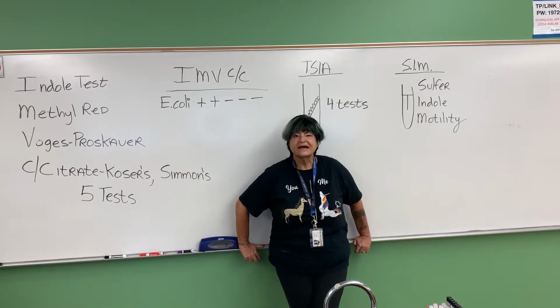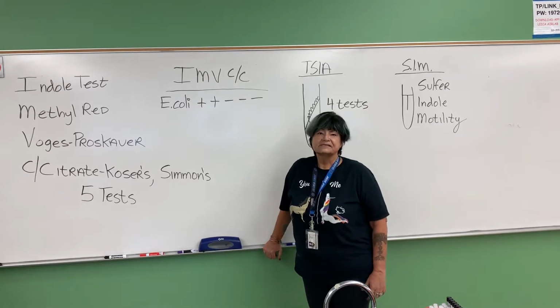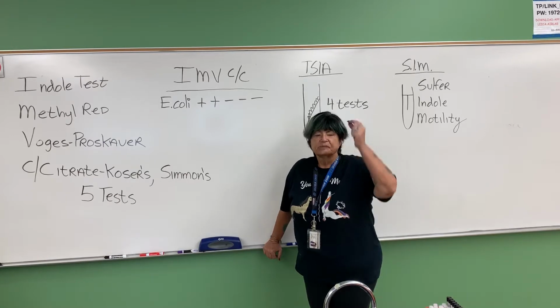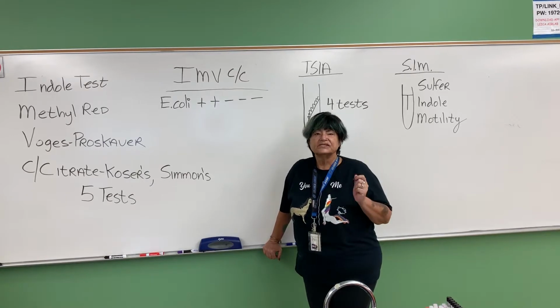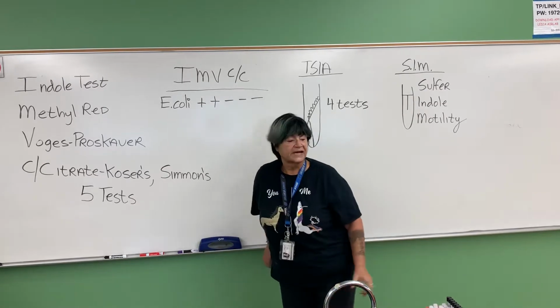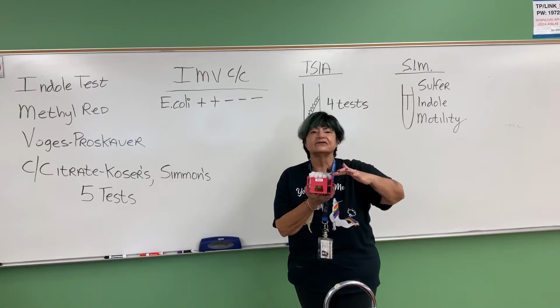Hi, last lab. Today's lab is on multiple test media, which means you have one tube of media and just by inoculating it, you can do a bunch of tests at the same time. So the first one is called the IMVIC test. That's this one here. It consists of 5 different tubes.